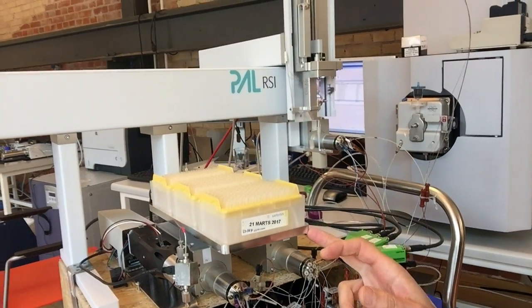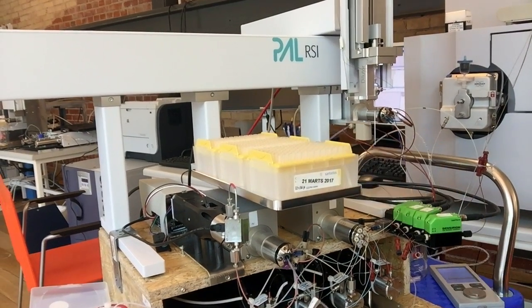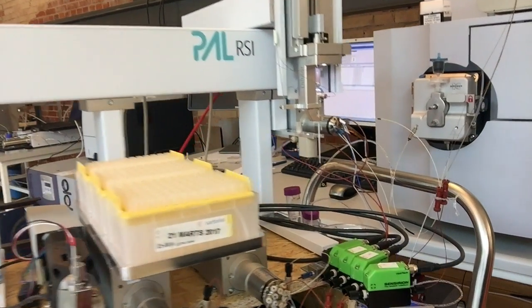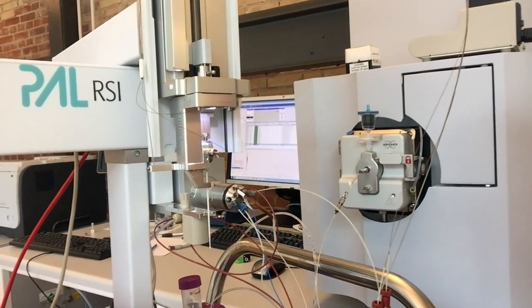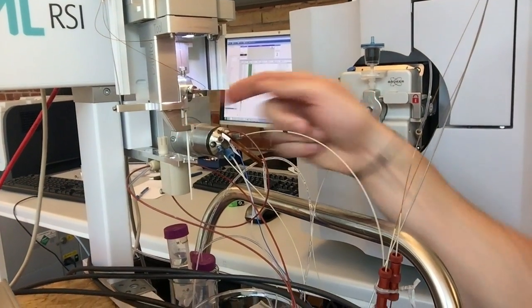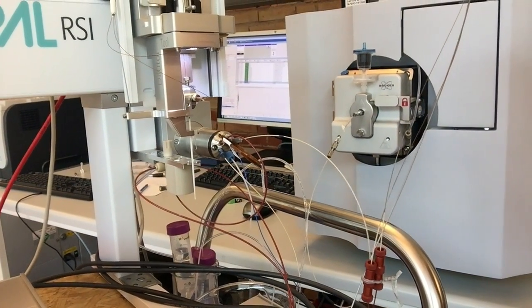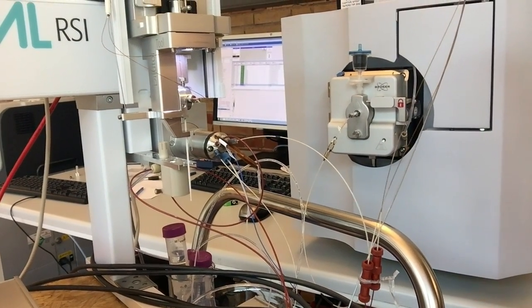Here we have the tip rack. This is also newly designed and really accommodates the tips quite nicely. If we take a look at the auto sampler, we can now see that it has just ejected a tip. But the tip cup has been upgraded with a tip alignment tool that makes sure that the tip is really oriented nicely into the receptacle.